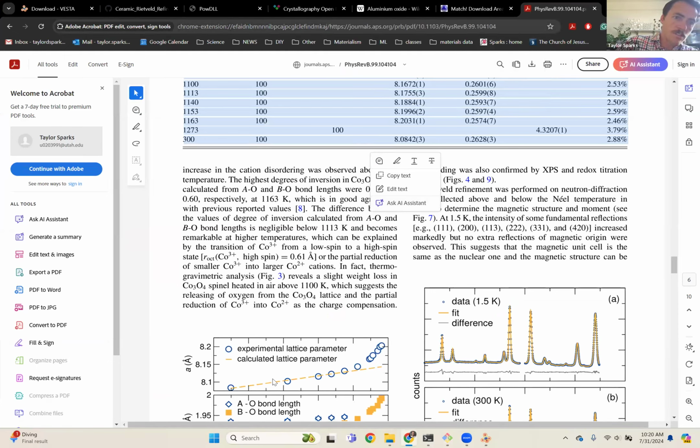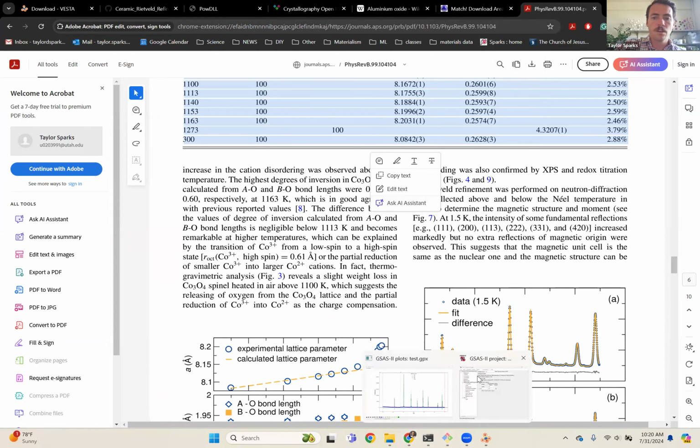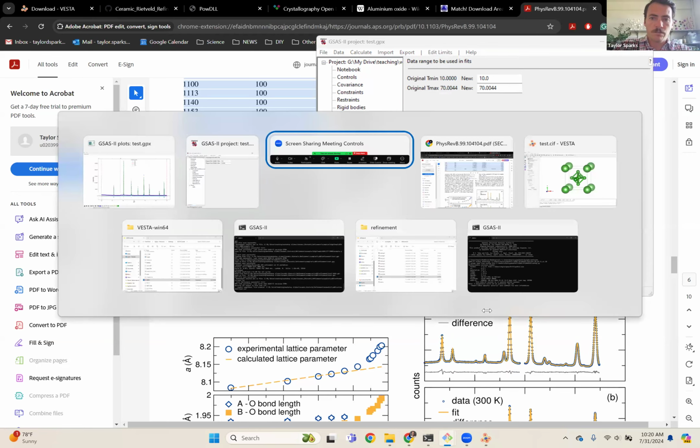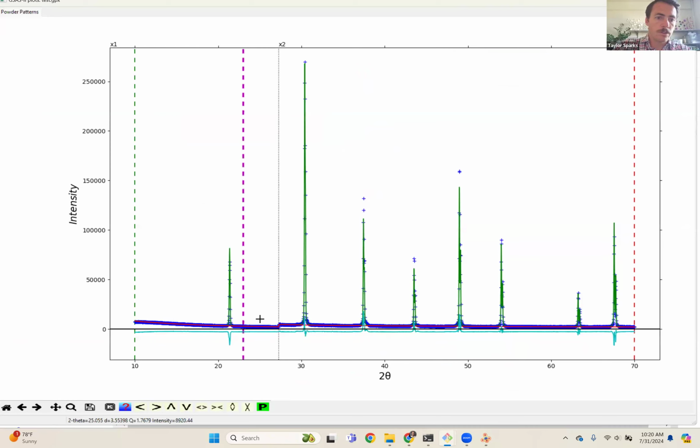Can you bring in the excluded area as well? Like if you accidentally exclude a region and you want to delete it, then you can. Is that the question? I'm not sure. If you incorrectly excluded a region, you can just go to that region under your limits. Like if I come over here and I go to my limits, if I had added an excluded region and it was incorrect, let me add a region real quick. Over here, like I wanted to exclude that region. And for whatever reason, that was wrong. So when you came over here and now you've got that, well, you can just delete it and that will get rid of that region.